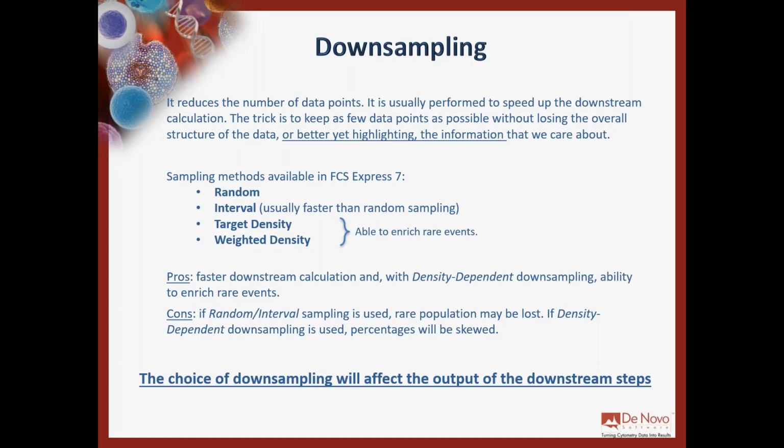Now you have one cell of interest out of 10. So before, in the original sample, the frequency was 1 out of 100. Now it's 1 out of 10, so 10%. So don't calculate percentages after this type of downsampling. But now that you know this, you can already imagine that that's not the idea of this type of downsampling.